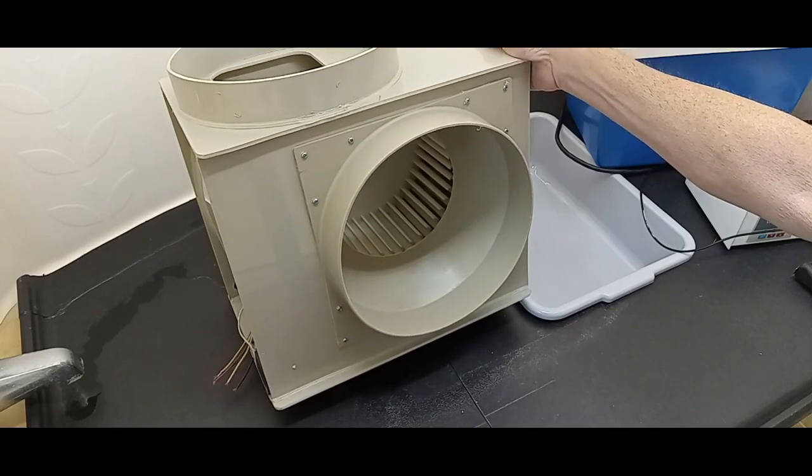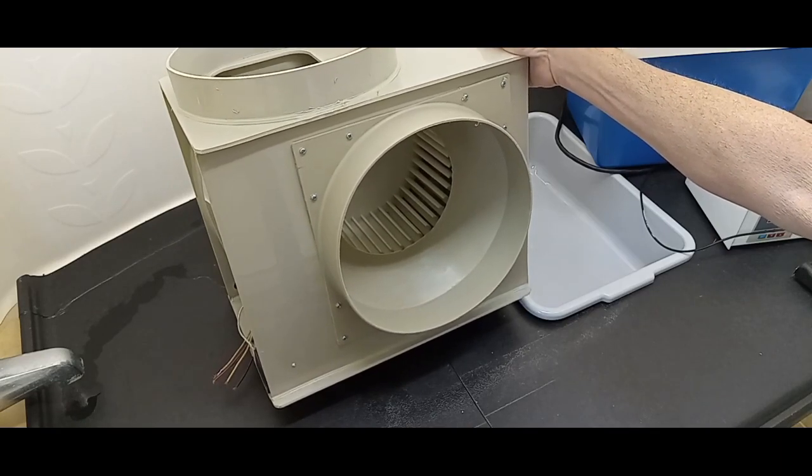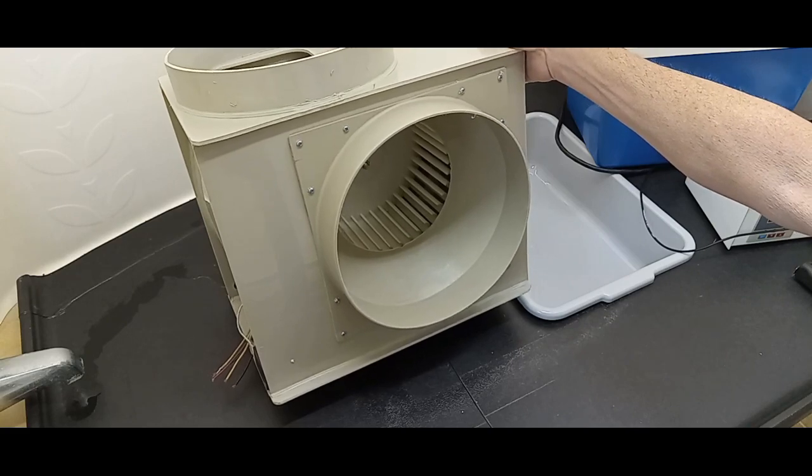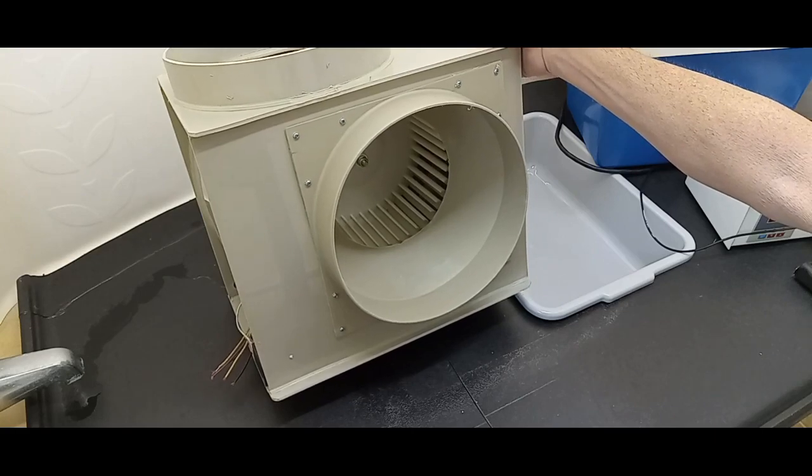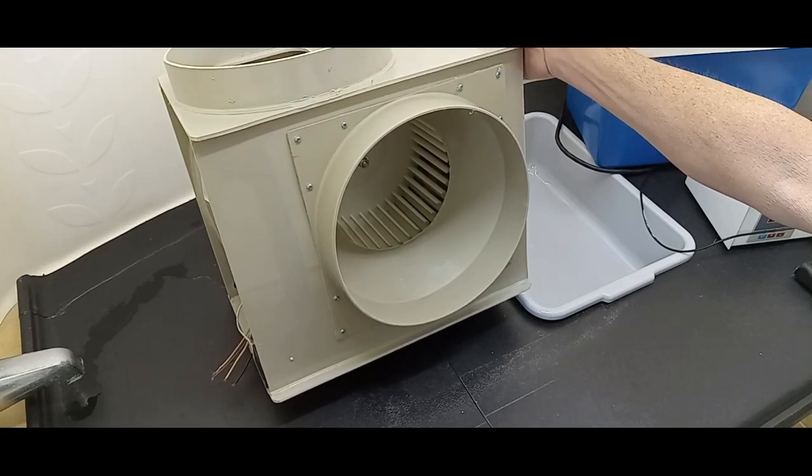These are sold on Amazon. They were being sold by four to five different people under four or five different names on Amazon, and then about a month and a half ago, they pulled all these fans off of Amazon for whatever reason.